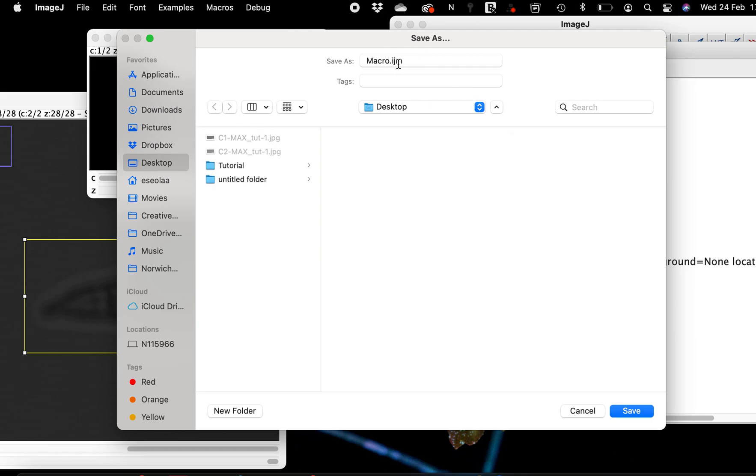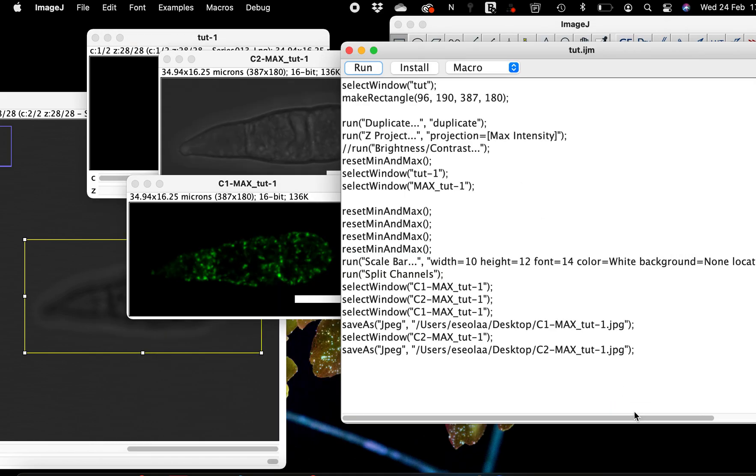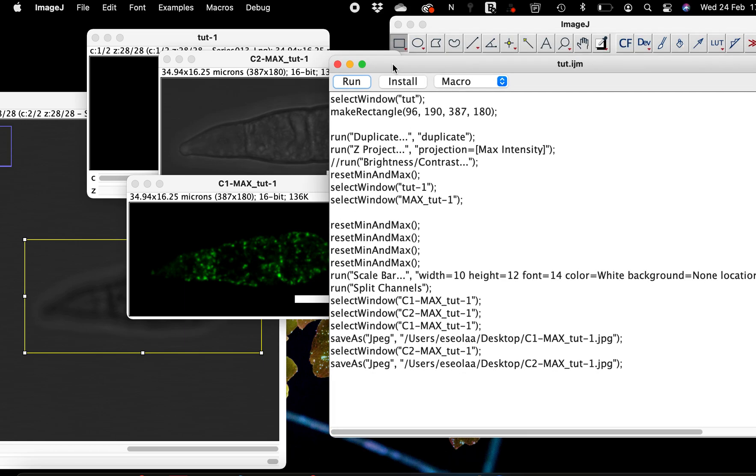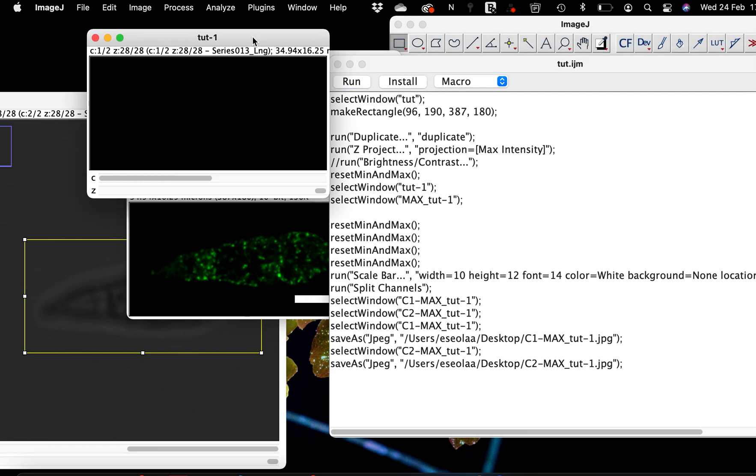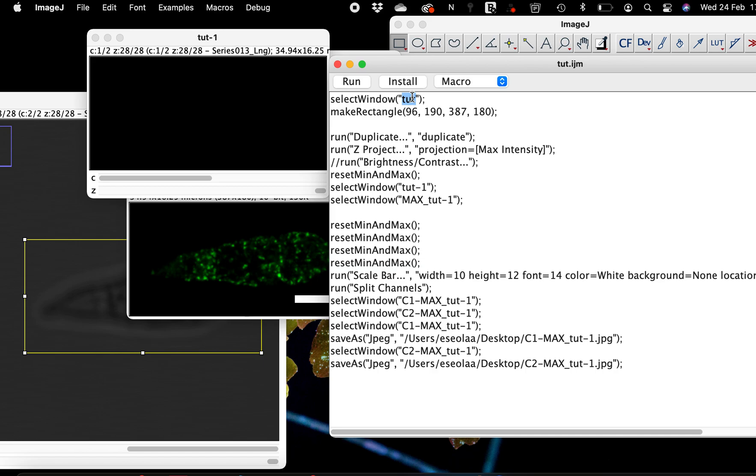And you can save your macro as it is. It will be like as ImageJ, so I can just say okay tutorial. So that's when next you open your image, all you have to do is run the same scripts on all your images. If your image name have changed, all you have to do is to replace the name with this select window. That's the only thing you have to do when you are reusing your macro on another image file.